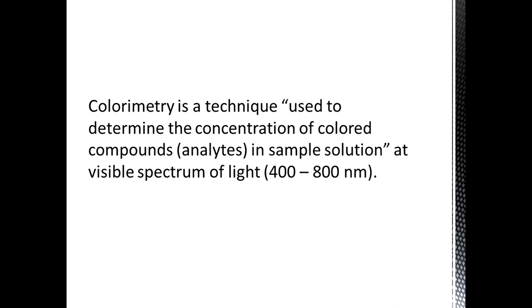So it can be defined as a technique used to determine the concentration of colored compounds, that is analytes, in the sample solution at the visible spectrum of light, 400 to 800 nanometer. Accurately saying, it's in the range 320 nanometer to 700 nanometer.